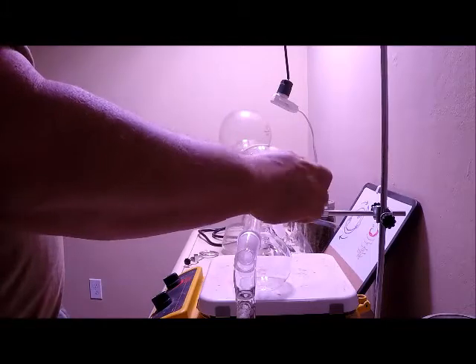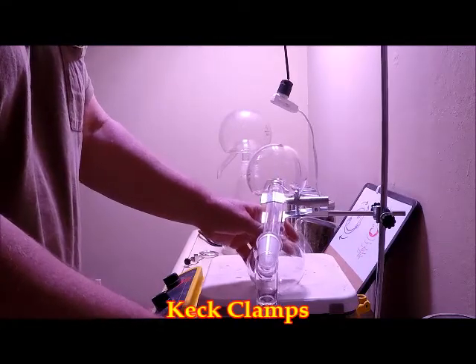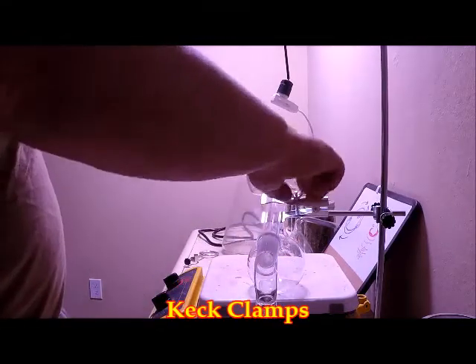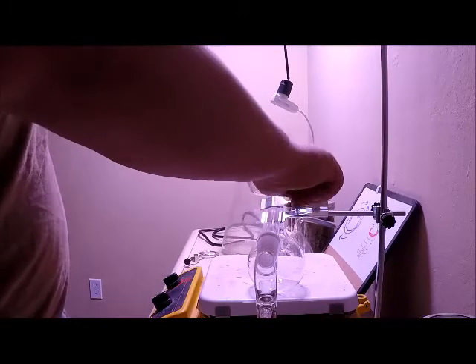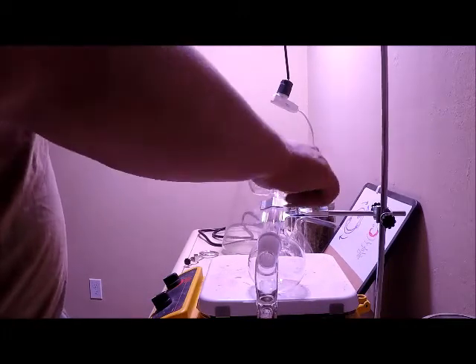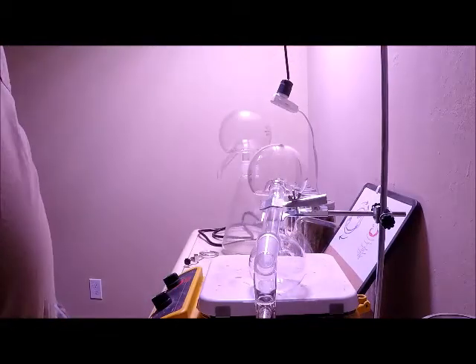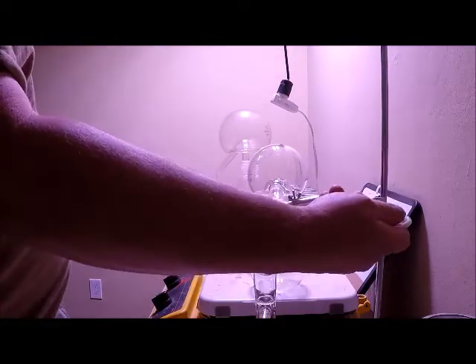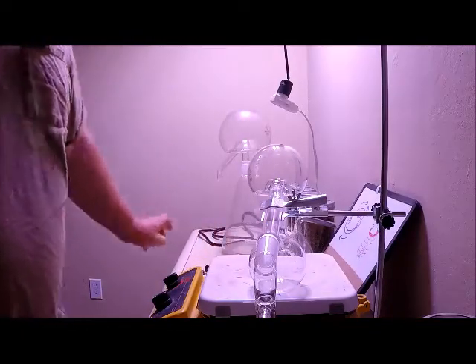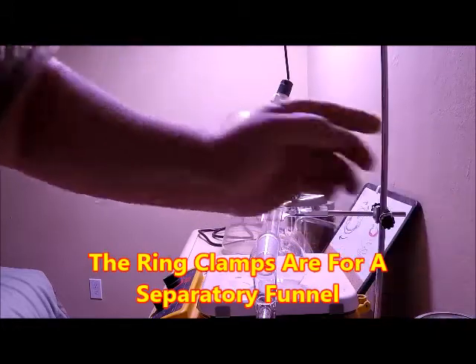I also have some keck clamps here that are purchased. This laboratory clamp stand will help keep things secure, prevent the falling over, and I have some more rings that I can add to it because I am considering adding a separatory funnel for the separation of plant oils, like this Echinacea purpurea. I want to extract and separate the oil.